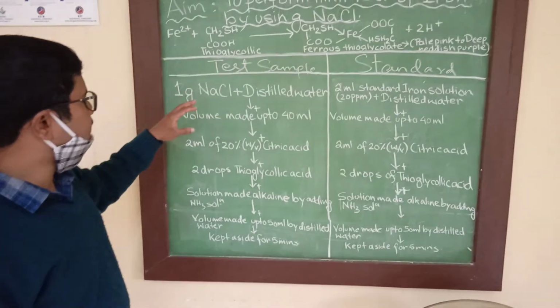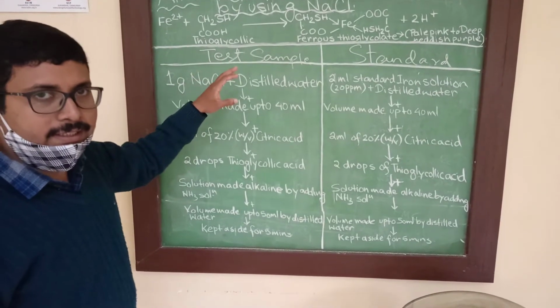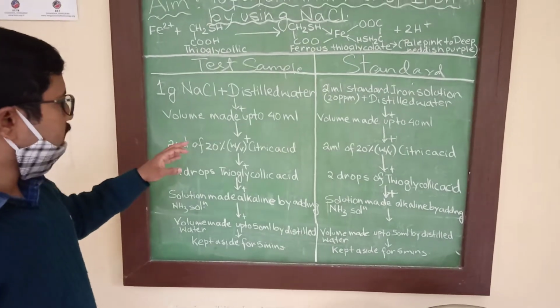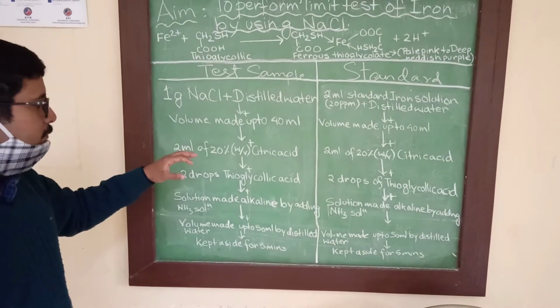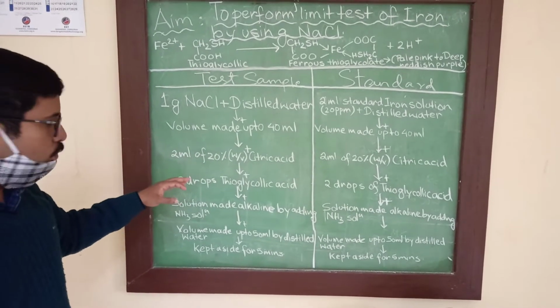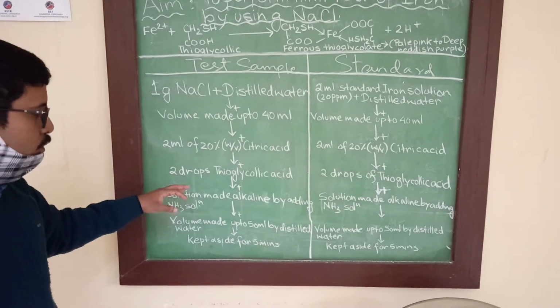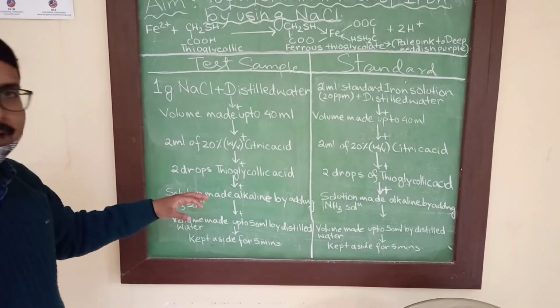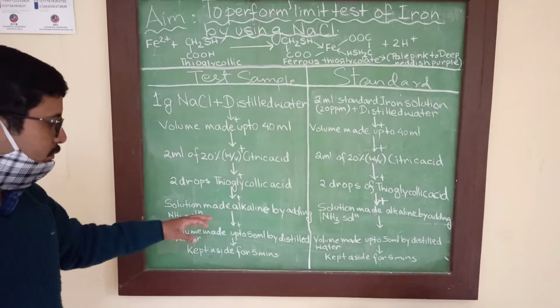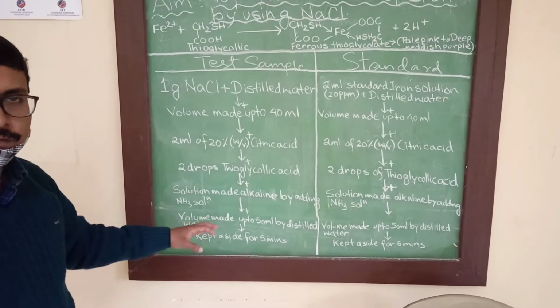simultaneously. In case of test sample, we will take 1 gram of sodium chloride and dissolve it in distilled water and make up the volume up to 40 ml. Then we will add 2 ml of 20% weight by volume of citric acid to it. After that, 2 drops of thioglycolic acid are added and the entire solution is made alkaline by adding ammonia solution. After that, the volume of this solution is made up to 50 ml with the help of distilled water, and the entire preparation is kept aside for 5 minutes.